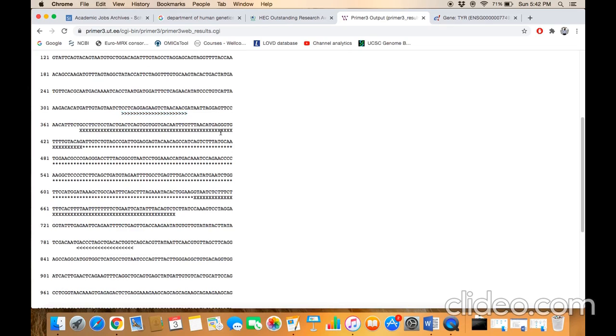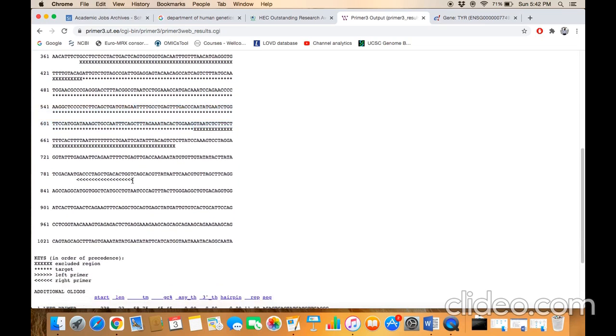this was the sequence you just pasted inside the query box. The forward arrow shows that the forward primer is picked from this position. This crossed-out region indicates the excluded region. The shaded region from here to here indicates the target region that you enclosed inside square brackets. This reverse arrow shows that the reverse primer is physically picked from this region.